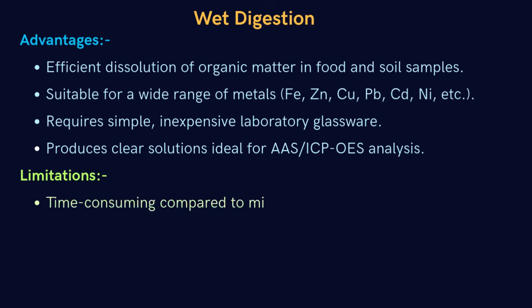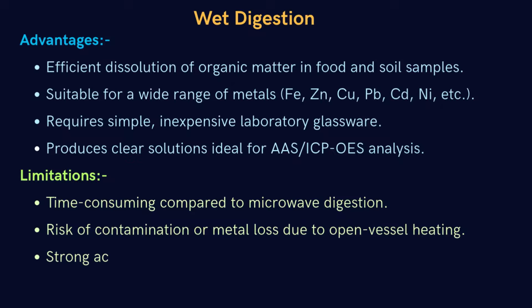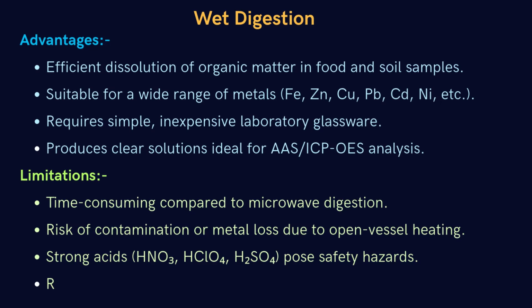And then the limitations of this method are: time consuming compared to microwave digestion. Risk of contamination or metal loss due to open vessel heating. Strong acids, nitric acid, perchloric acid, sulfuric acid, pose safety hazards.